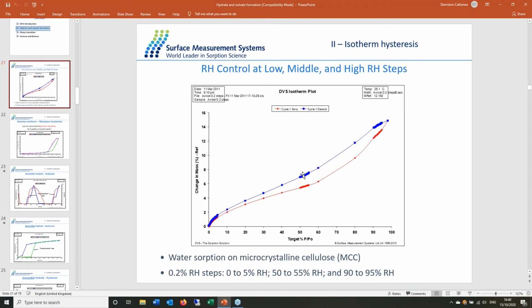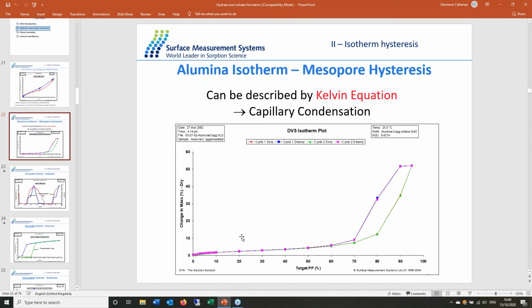Now, that's not to say that all the behaviors are the same. This is specifically related to bulk absorption. So when the molecules are going through the bulk. If you look at condition, for example, on surface sorption, so right here, this data, the first section, is pure surface sorption. And in this case, there is no bulk absorption, so there is no interaction of molecules through the bulk. So thermodynamically, the molecules have no energy required to move in or out. In that case, there is no gap of hysteresis.